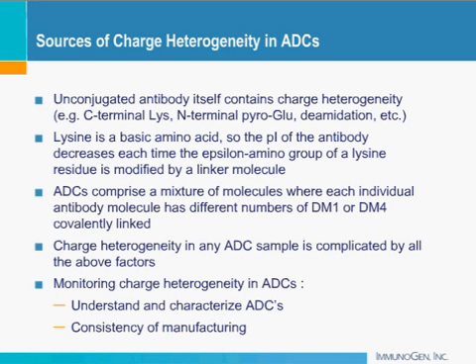As we can see clearly from the figures, Servolyte for this conjugate did not work very well, and you don't see very clear separation of species, and there is some noise in the baseline. But using Pharmalytes, we have a very clean and nice baseline, and nice resolution of many species of the ADC is seen.